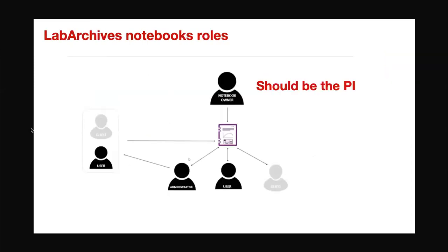Each notebook can have different roles. So the most important role is the notebook owner, and I said it should be the PI. And then there are the users who access the lab, basically the researchers in the lab who are using the lab notebook.